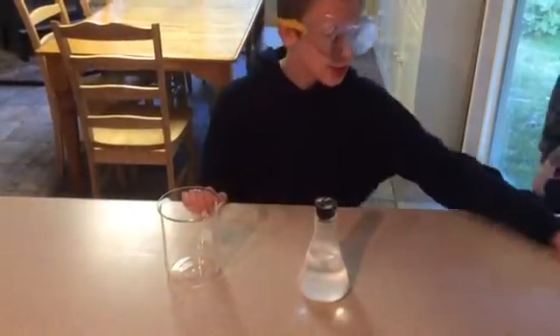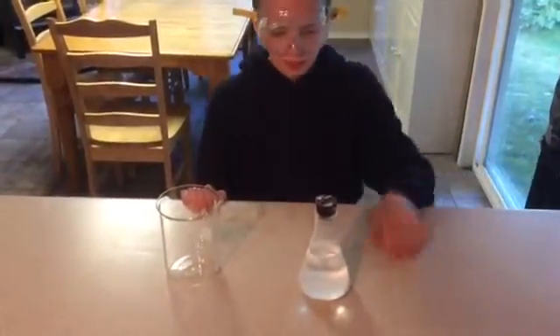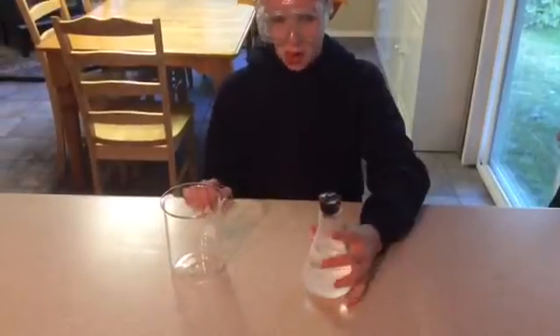Hi, this is Michelle from Layers of Learning. Today we are going to show you how to decant a liquid in chemistry.